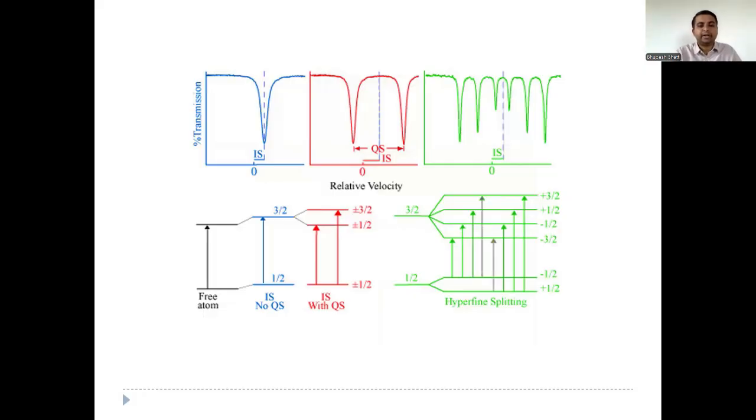So in one diagram, we can see that this is the isomer shift. It is on the positive side in this case. The x scale over here is in millimeters per second. That is the velocity of that reciprocating motor, and the magnitude is in millimeters per second. So ultimately this is going to show the energy of gamma radiation, because based upon the velocity of that motor, we will have gamma radiation of different energy. And over here we have the count of gamma radiation.